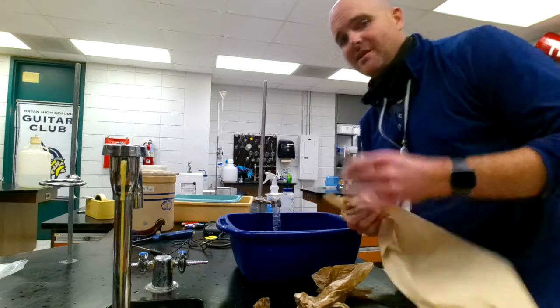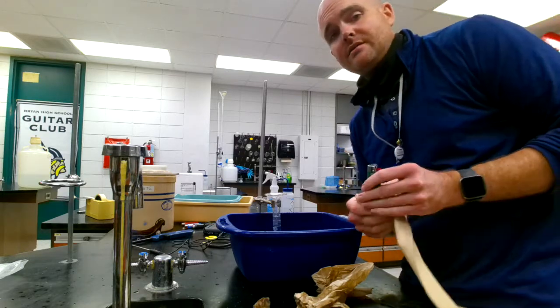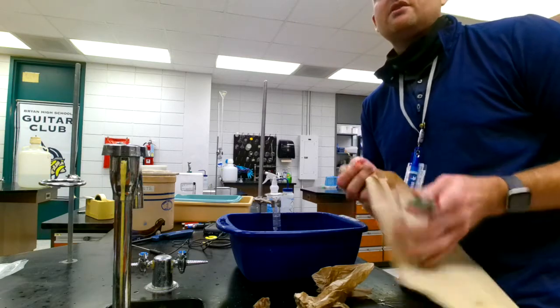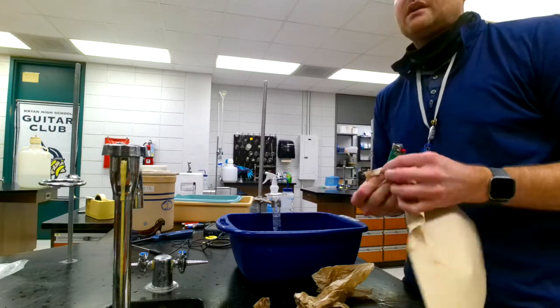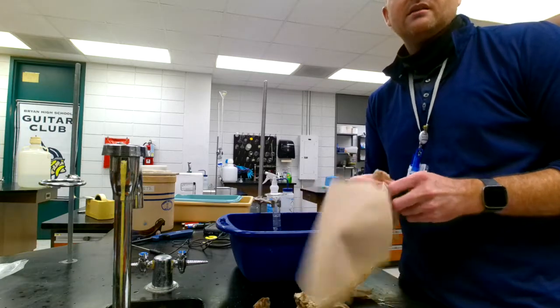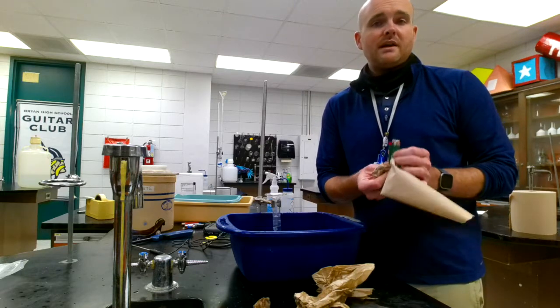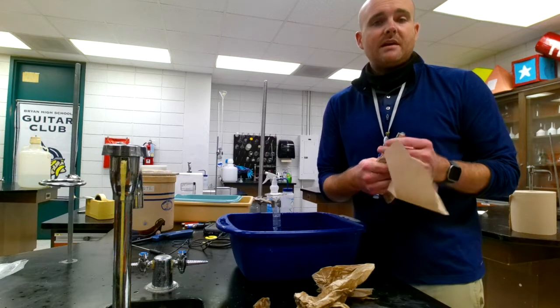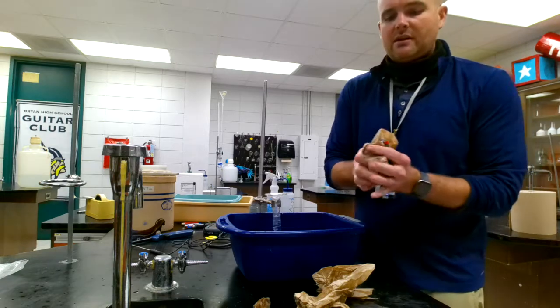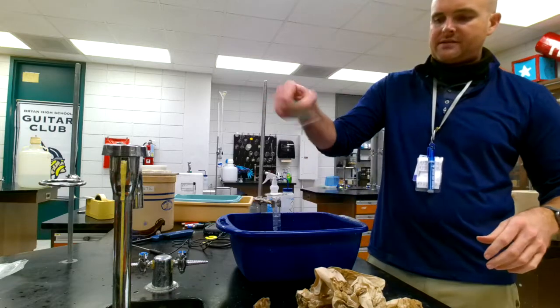What kind of error would that be? How would it affect your data? Oh, good question. In this lab, you do not need to do any propagation of error. I'm not really concerned with your uncertainty. We will just not concern ourselves this time. If you were doing it for your IA, absolutely you would do that, but your biggest source of error is going to be your systematic error. I'm not really concerned with the random error. So the uncertainty is not really going to be much of an issue here. So hopefully we bled out all the systematic error we could.